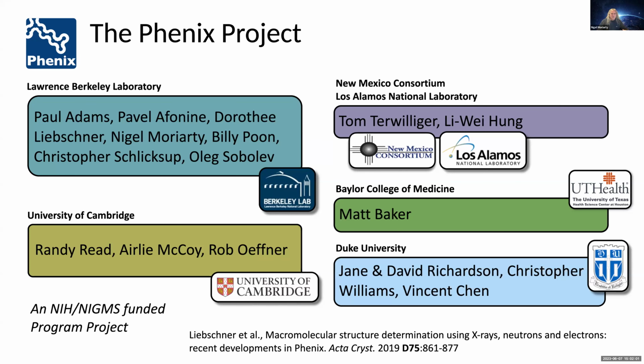I haven't finished writing the documentation, but that's one of the things I was hoping the user would do. They would say, "Oh, I've got a MOPAC model. This has calculated this density, this geometry. How can I change it to be more specific to my specific case?" And I can imagine one thing they might do is remove a water molecule and see what happens to the geometry. Okay.